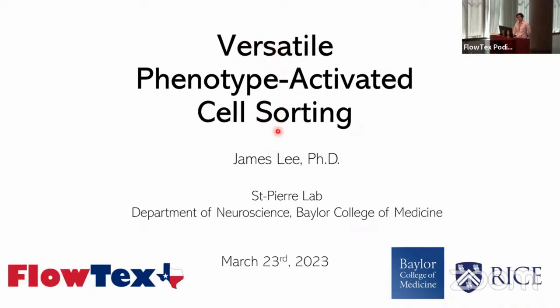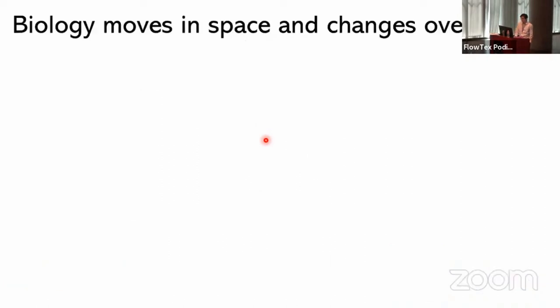So at the end, it's basically trying to increase the things that you want to study and visualize, and allowing isolation of interesting cells that show spatial and temporal properties, and then sorting those cells for downstream profiling and other kinds of experiments. So for the next 10 minutes or so, I would like to inform you of this new method that combines microscopy and FACS together and maybe inspire some of you to try the method out yourself.